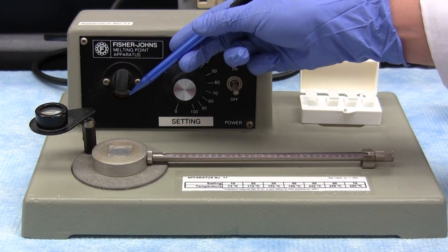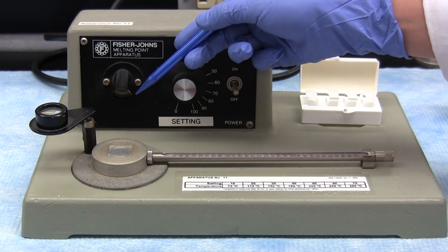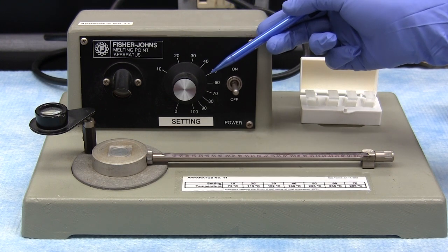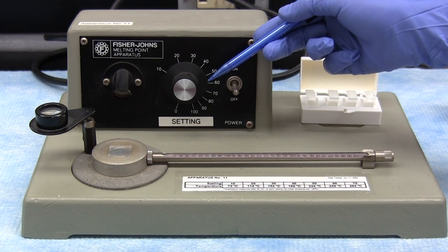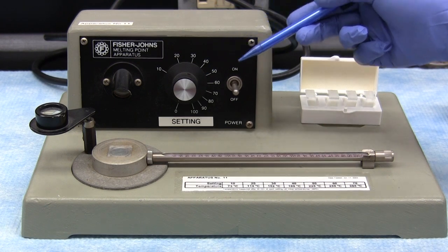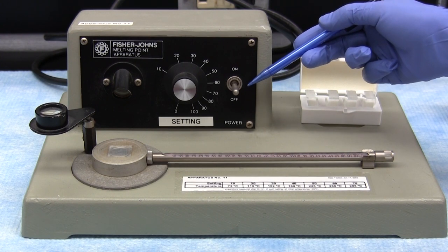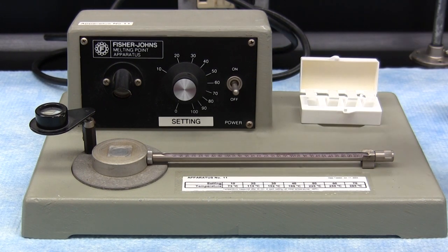An illuminating lamp directs light towards the center of the stage, and this further aids in viewing the solid as it's heated. The heat control knob can be adjusted so as to regulate the temperature and the rate of heating. And the on-off toggle switch supplies power to the heater and to the illuminating lamp.